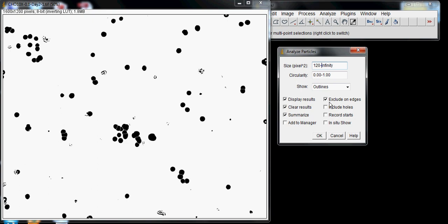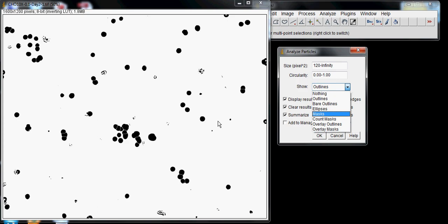Show Outlines traces the outline of cells. When you select Masks, it shows you an image like the mask you see here. We'll choose Outlines because it will show us the cell numbers.